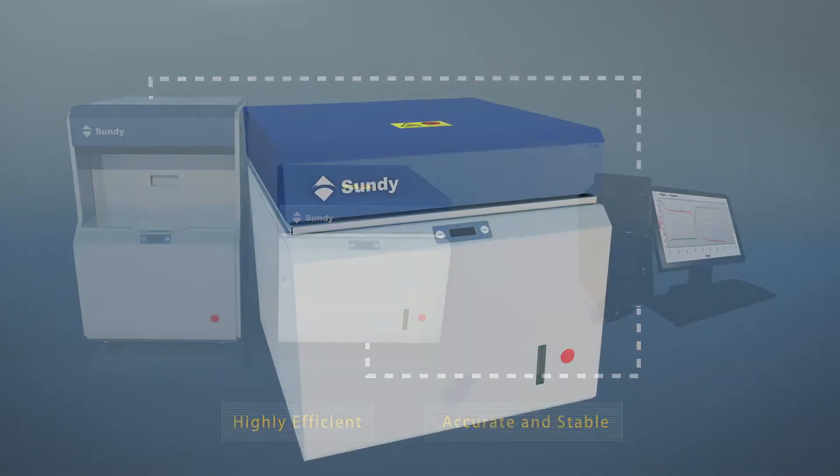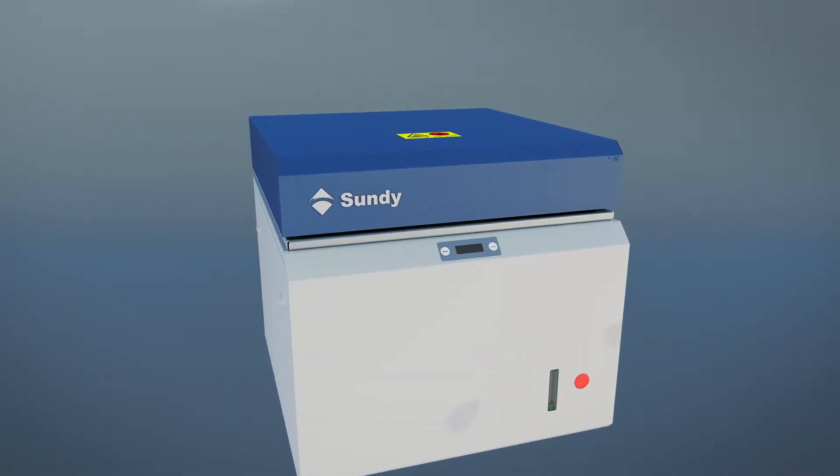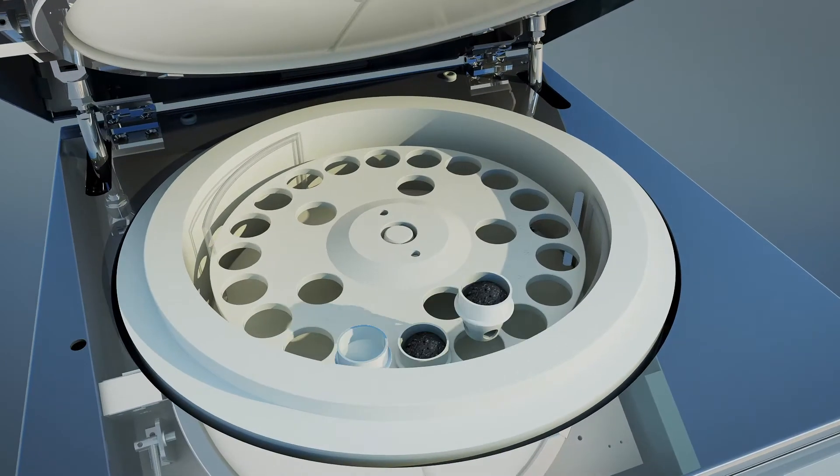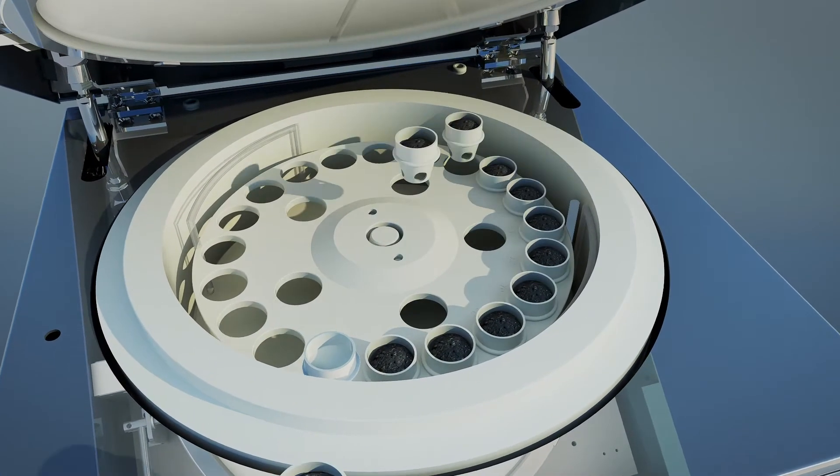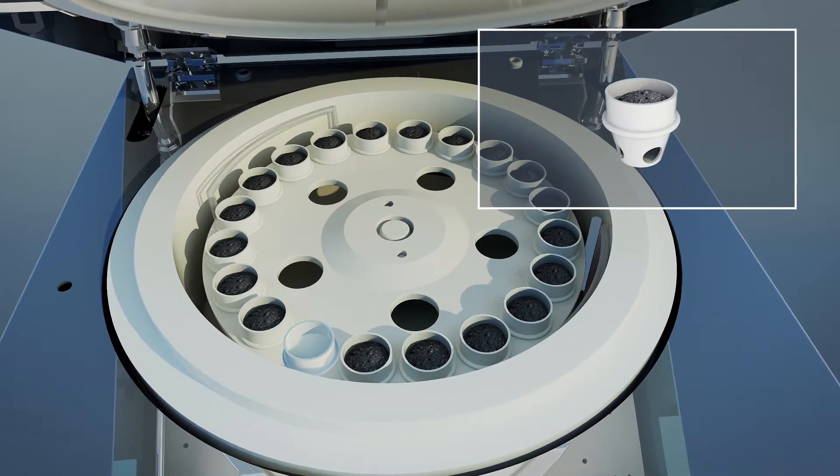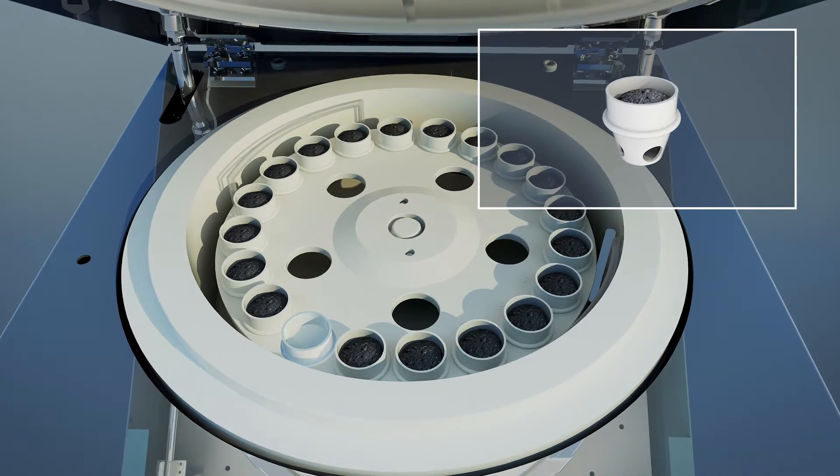The SDTGA 6000 can start the test immediately. With a single startup, it can analyze two batches, 38 samples, including sample weighing and cooling, in one working day, 8 hours.